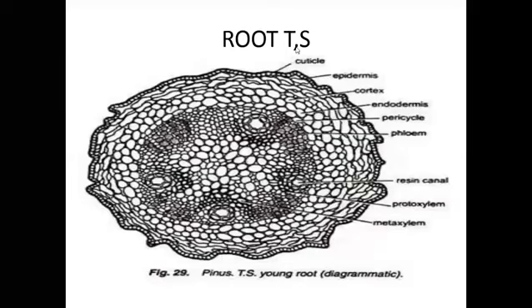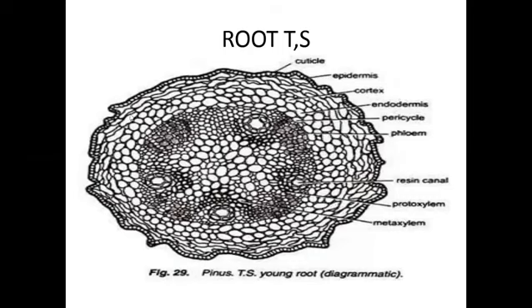Pinus root TS (transverse section) shows a spiroidal outline with ridges and furrows. It shows mainly three major portions: one is epidermis, second one is cortex, and third one is stele. The epidermis is the outermost layer.